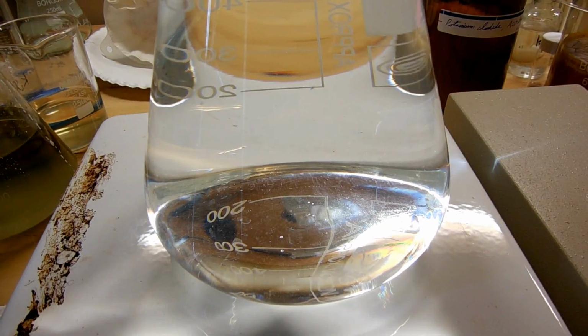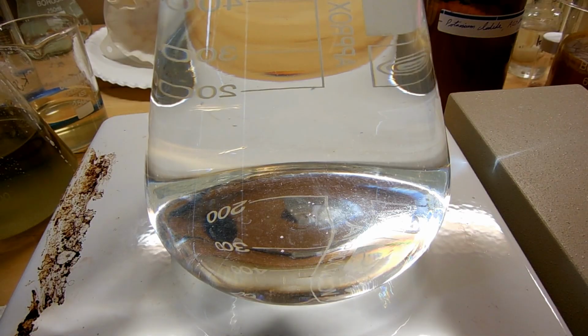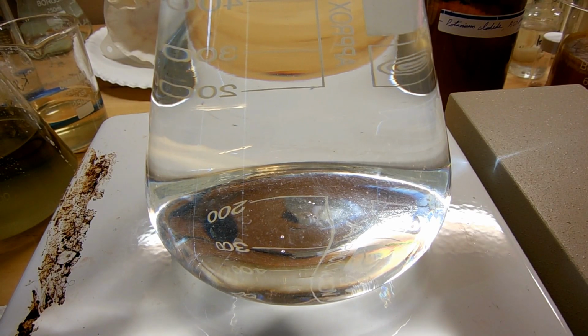All right, it's been about 20 minutes and everything is completely dissolved into solution, so it's totally water clear now, which is pretty amazing in itself. This is very hot, it's near boiling, so you might see a couple of bubbles in there. So now I'm going to turn the heat off and let it cool down back to room temperature. So all this iodide should come back out of solution and do the nice golden rain part of the demo. So we're going to move this over to a nicer area for filming this.